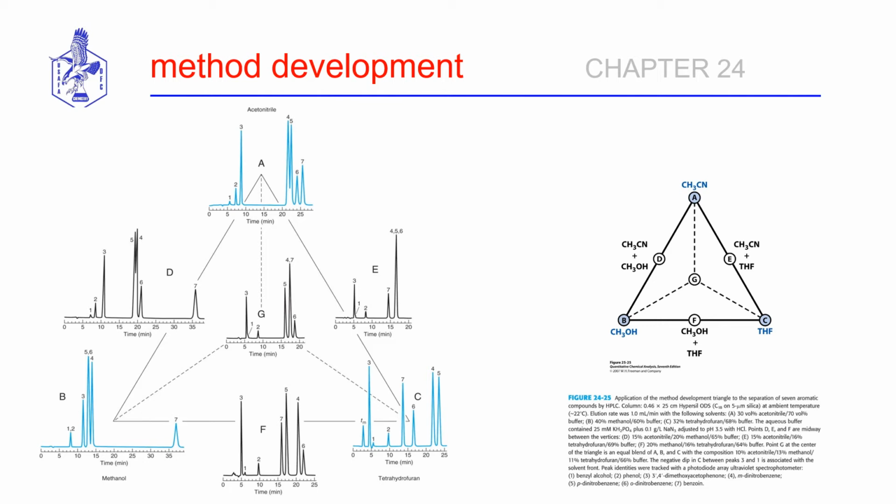So is there a systematic way that we can go about to hone in on the sweet spot of combination of organic solvents to use in the mobile phase that affects the best resolution in the shortest amount of time possible? So typically the way this is done is we have a computer at our aid, which is going to help us model the resultant chromatograms we're going to get with different combinations of mobile phases and eluent strength.